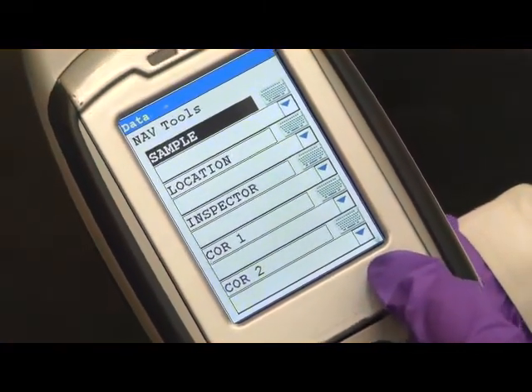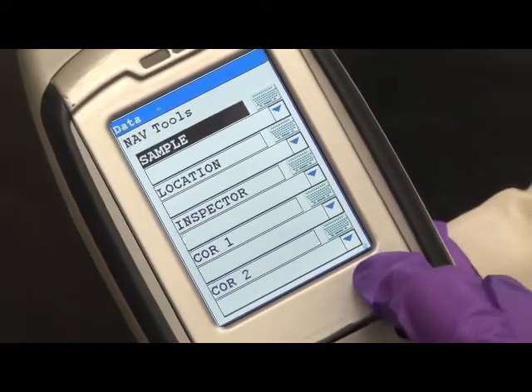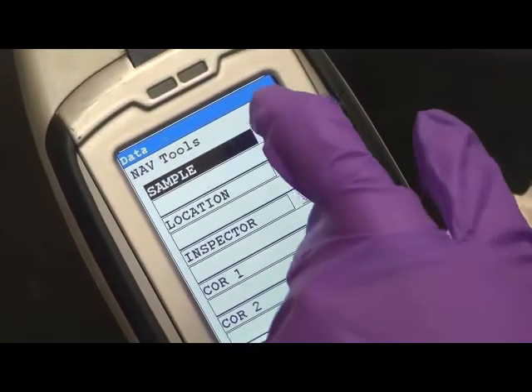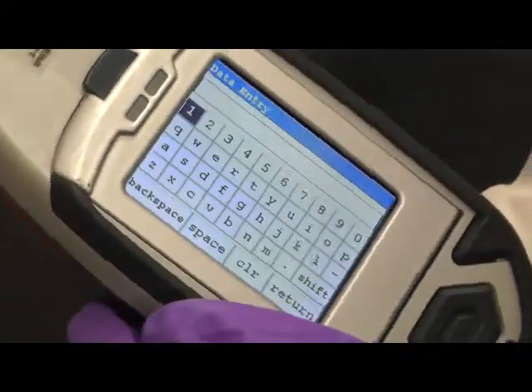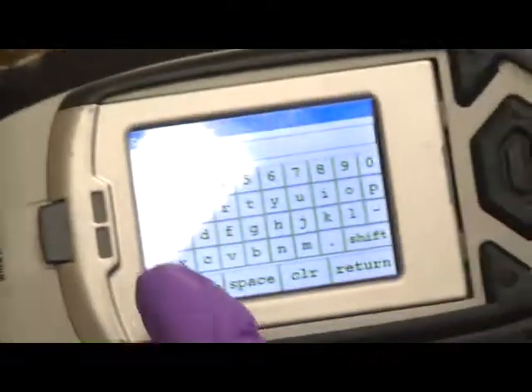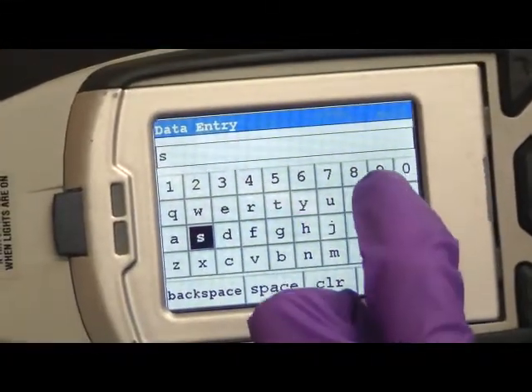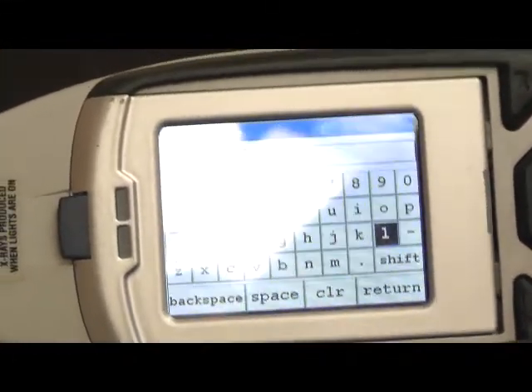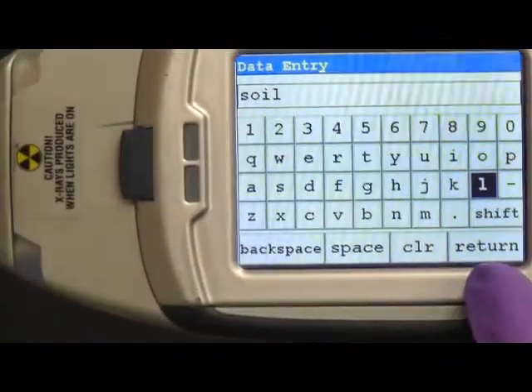Here it requires us to input a sample name. So we click on the keyboard. I will just call this sample soil. And then click return.